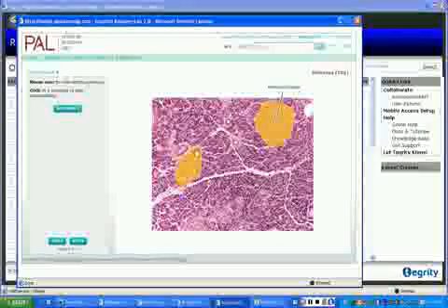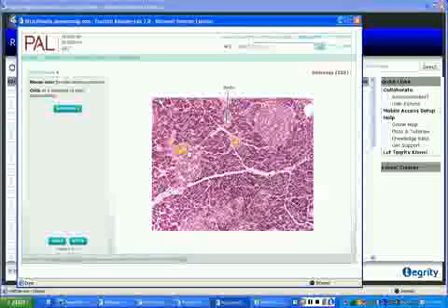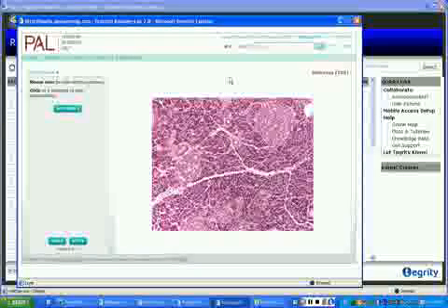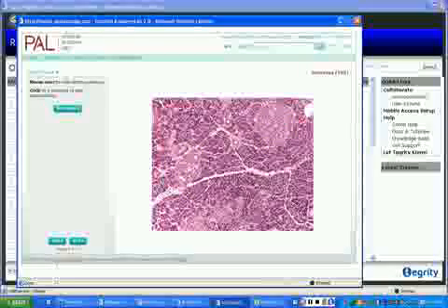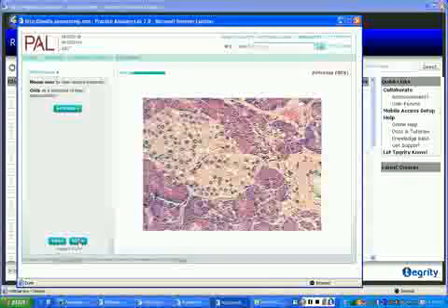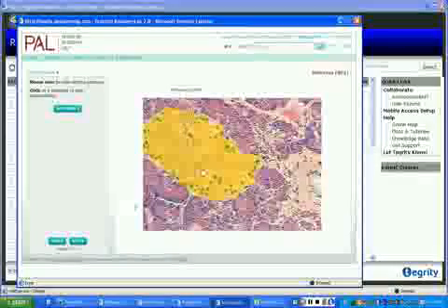Yes, they are. But only which one makes the hormones? Only the islets. Good. Oh, here's a pretty islet. Right there.